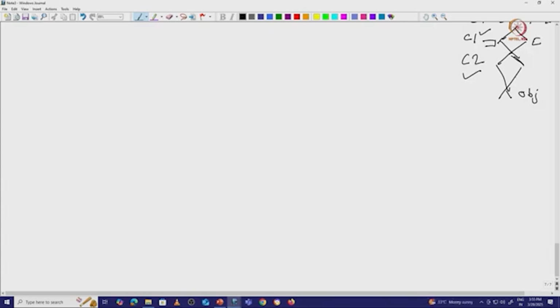So now we'll draw the same diagram again. We have electrons and the crossover point is somewhere here, right? And then, as I mentioned, there will be a C2 lens, and it will measure the crossover point here.